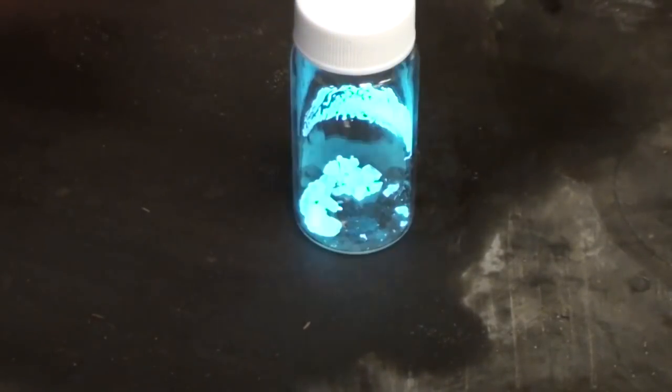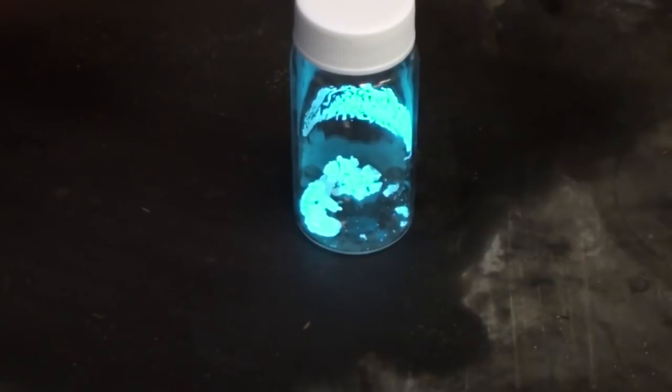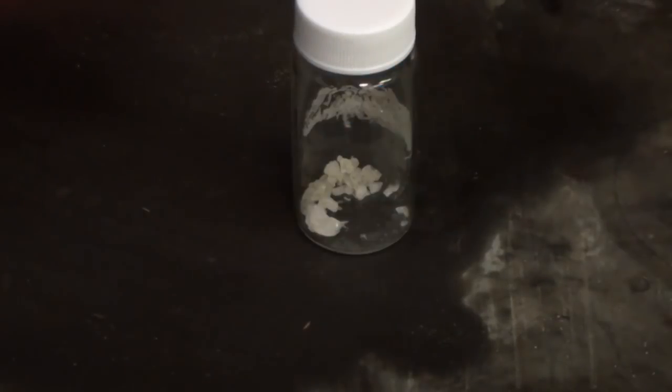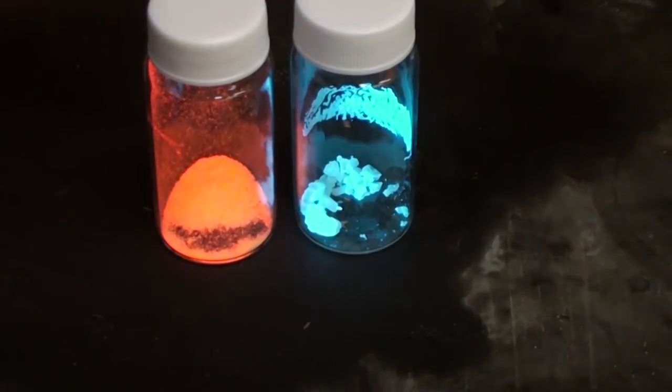Under ultraviolet light these crystals exhibit a nice blue fluorescence. This is the same color it will glow when smashed. While not quite as brilliant as the original red smashed glow crystals, it's still quite bright.